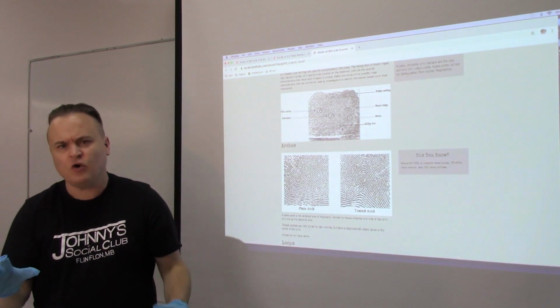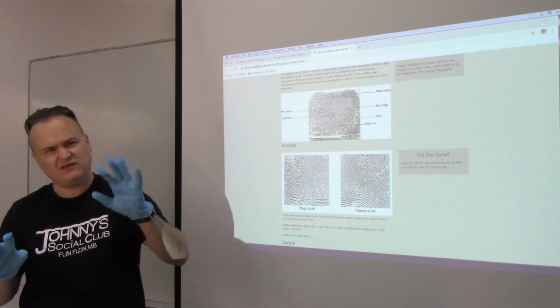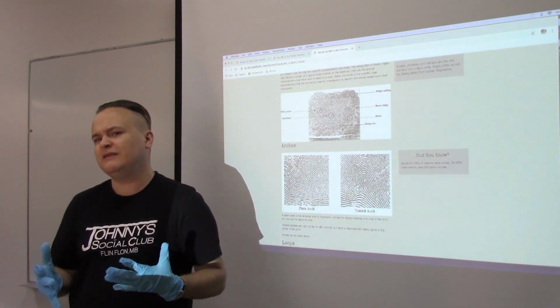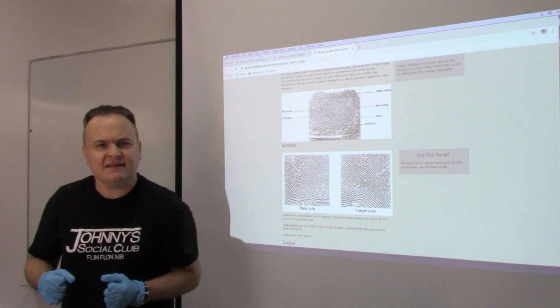It's normally hard surfaces that leave good prints. You can't really leave a good fingerprint on paper. It's possible, but it's not as good as metal or glass. So prints are only good on certain things, and only if they're preserved. So say you see a fingerprint. What do you do? You just take your camera and go click, we got the fingerprint. You can't see anything.